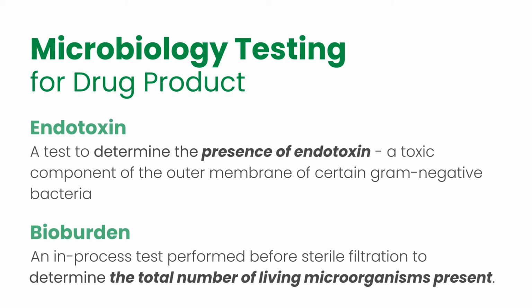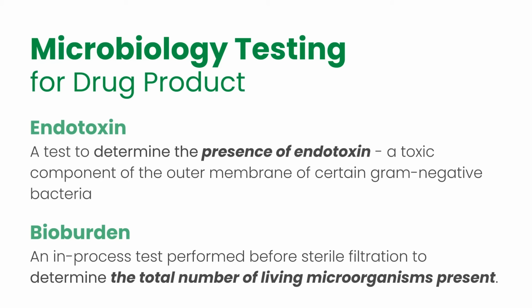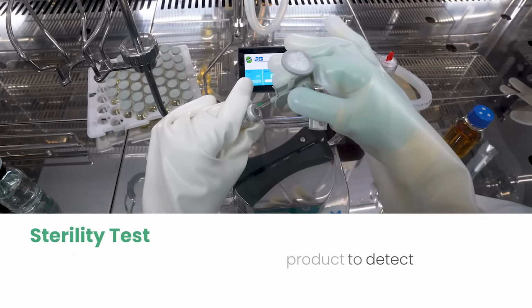The other major aspect of testing that the microbiology department does is on the product. So besides environmental monitoring, they also assess products for endotoxin and bioburden, and they do the sterility test.